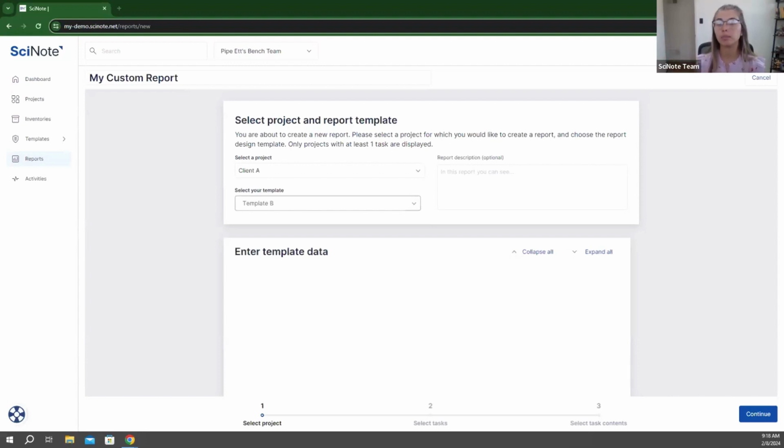That's something, Shama, I don't know if you know, but I would take that question back to our technical team to talk with them. Just because I know you can change the due date of different tasks, and you can set it to a date in the past, but I don't know about at the project level.